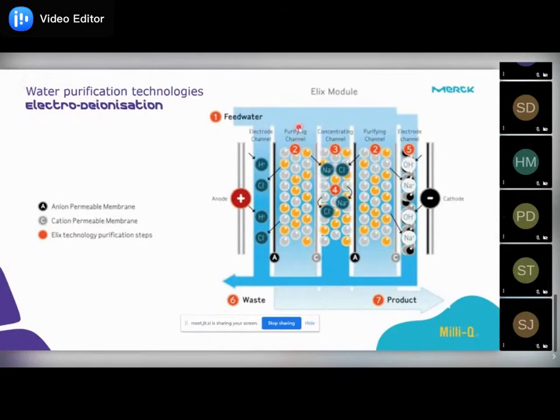So whatever water is coming over in the first, second compartment and the fourth compartment, you can clearly see all the anion is passing through the first compartment and the cation is passing through the third compartment. Same thing is happening in both these compartments, second compartment and the fifth compartment. So final water, whatever you are getting as the product water, it is majorly free from ionic contamination. So this is an extremely strong tool so that we can actually take care of various kind of ions.